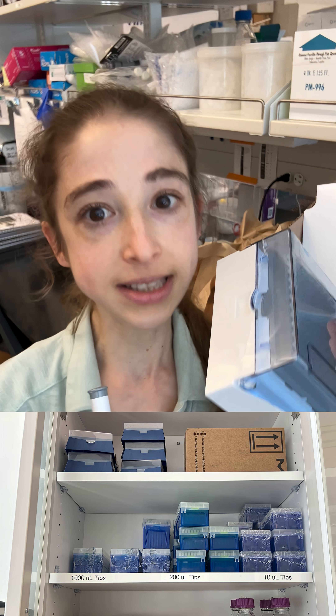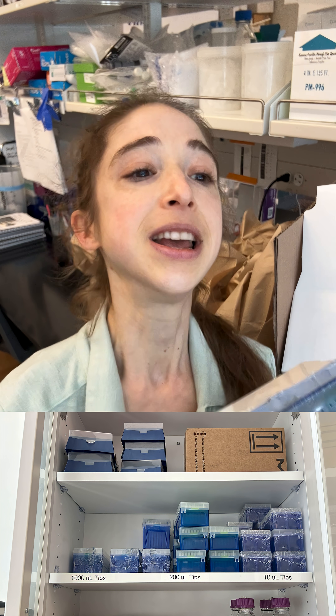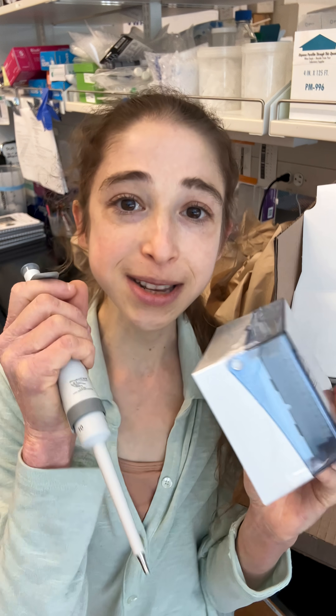Whereas the P-10 uses the same tips as the P-2, so you get to use these smaller tips. You lose less, you have better accuracy, better precision.